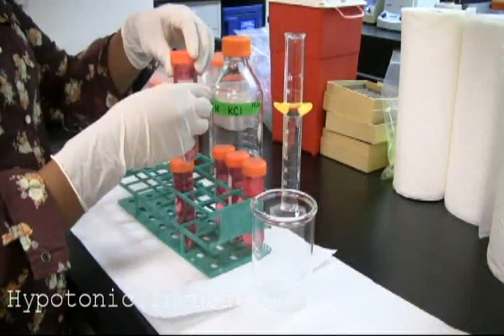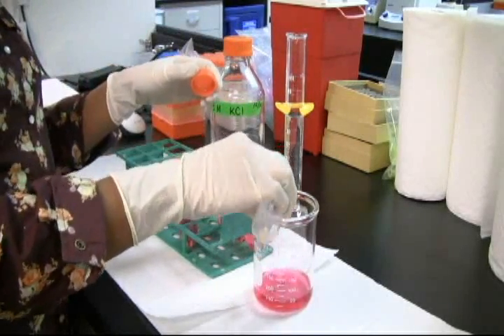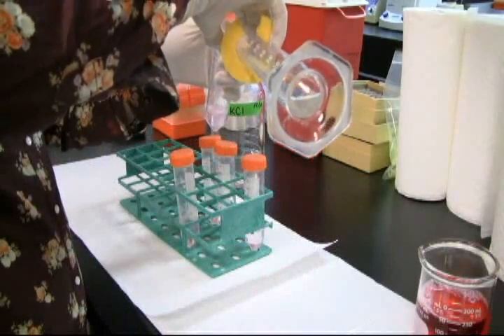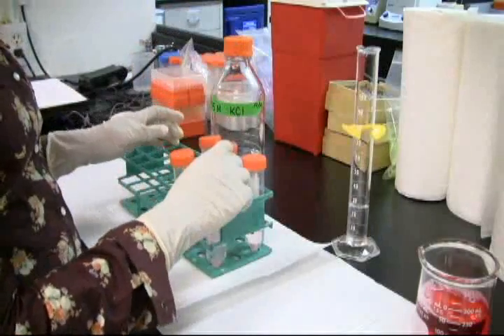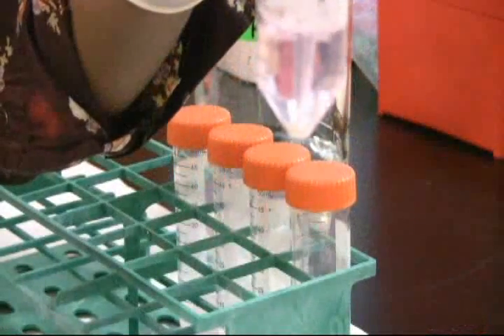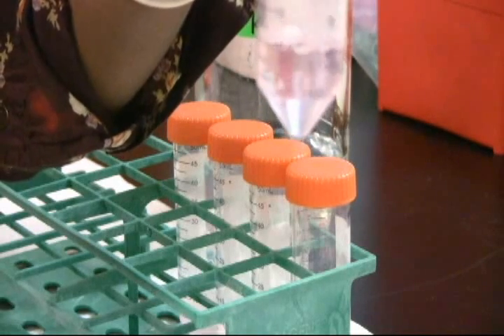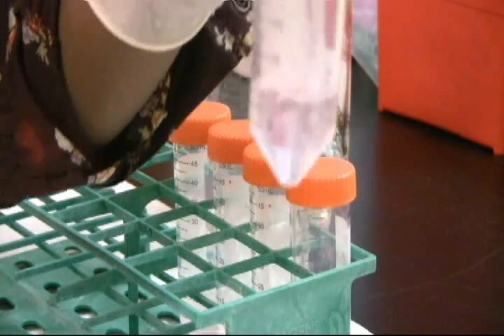Decant the supernatant and re-suspend the pellet in approximately 10 mL of hypotonic 0.075 molar KCl solution. Incubate at 37 degrees for 20 to 30 minutes. When the HeLa cells are exposed to a hypotonic environment, the cell will eventually lyse and rupture due to osmotic pressure.